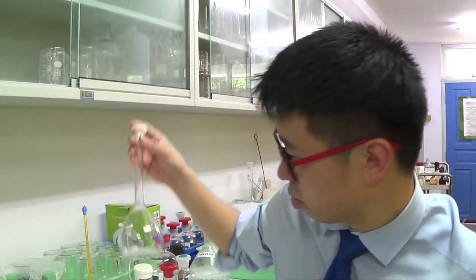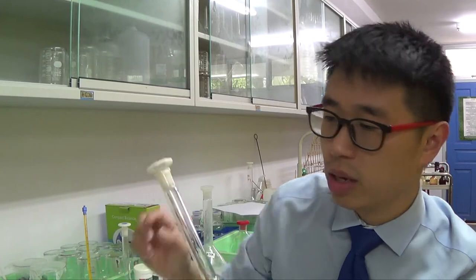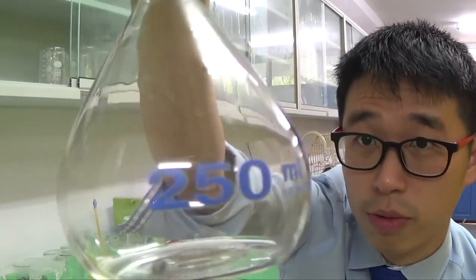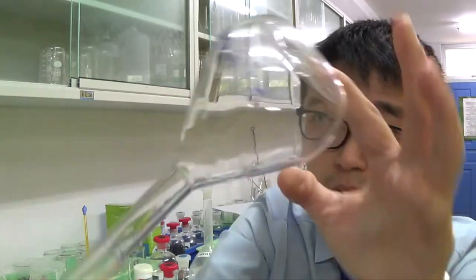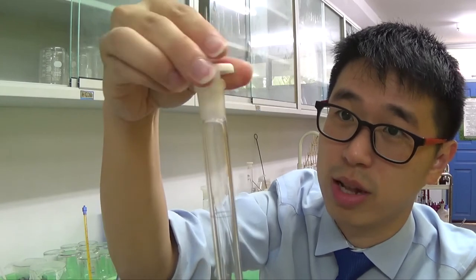We want to make a stock solution, going from the solid itself to a solution. I'm going to make it up to 250 cm³. This is a 250 ml volumetric flask. It's got a blue mark indicating the 250 cm³ level, and it has a stopper because we're going to shake it to get a uniform concentration later on.